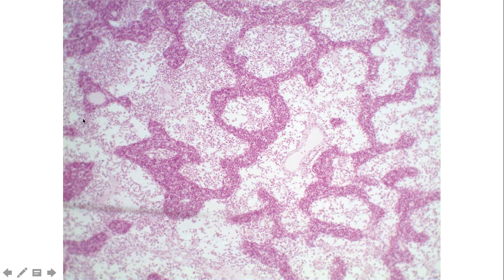And so this last figure here is really a nice figure of the medulla. We do not see those lymph follicles, right? We see these more linear structures of lymphocytes. They're not arranged in those nice circular structures like we saw before. And all the clear space here would be the sinuses. This is where the lymph fluid is moving its way through. And because we're in the medulla, we would call these the medullary sinuses.